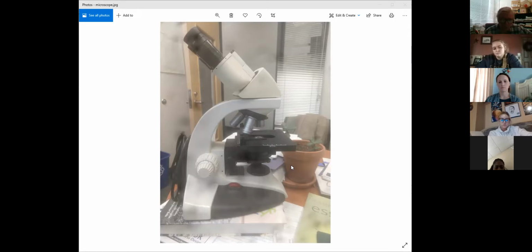Yeah, I think that's it for the parts of the microscope. You may have any questions, anytime, don't worry about interrupting me about a question about anything. Well, there's one more wheel here that moves the substage condenser up and down, but we generally don't use that. We don't use that. Okay.